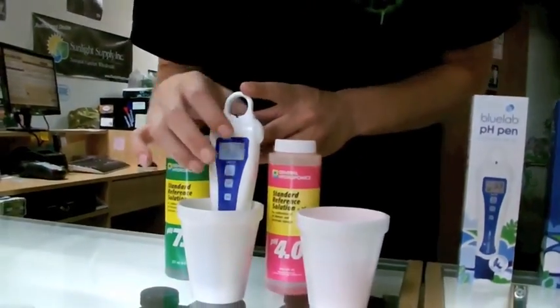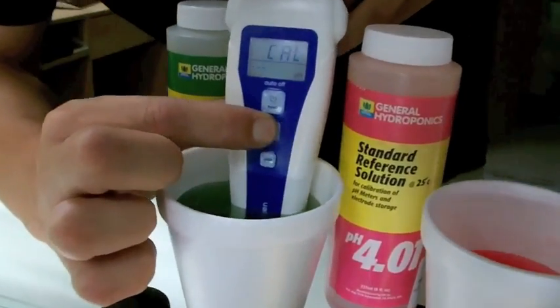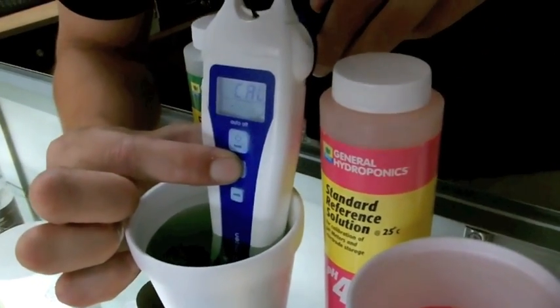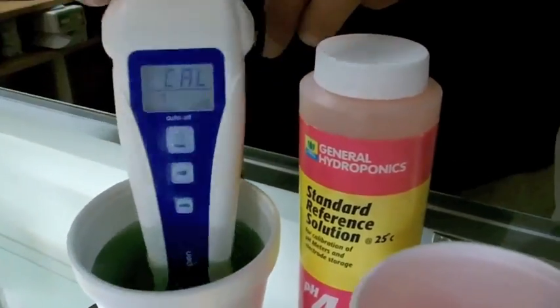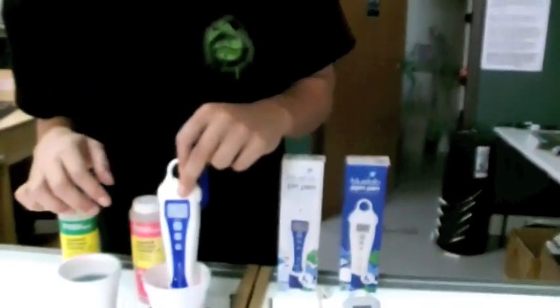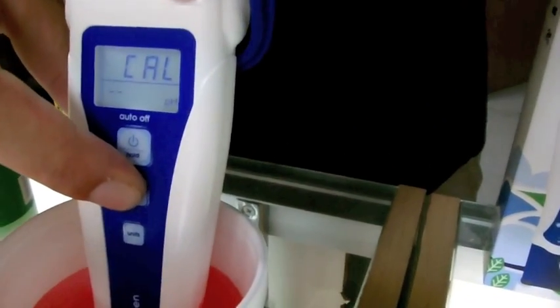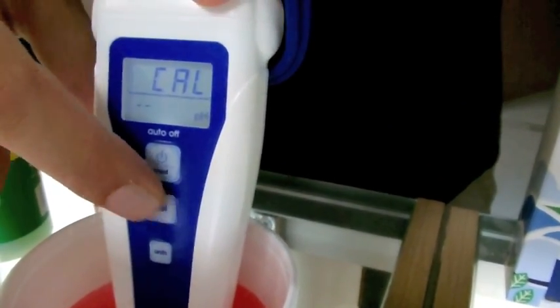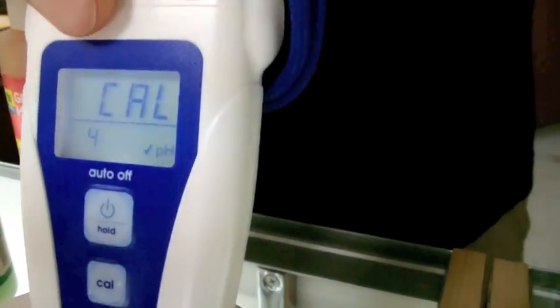I'm simply going to pop off this cap, turn it on. Now I'm going to put it in the green 7.0 solution here. All you need to do is hold down the Cal button for calibration, and you should see the number 7 pop up for a 7.0. Now we see the 7, so we're simply going to move over here, do the same thing for a 2-point, more accurate calibration, and the pink 4.0 solution. I'm just going to hold down Cal, see the blinking, release it, and see the number 4. Now you have a check mark pop up there, so you know you've got an accurate calibration at 2 points.